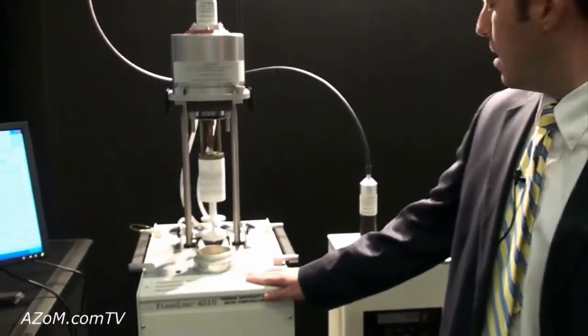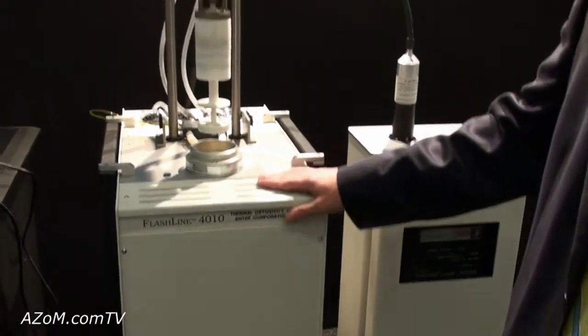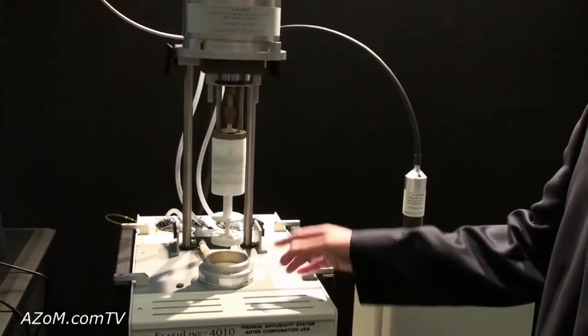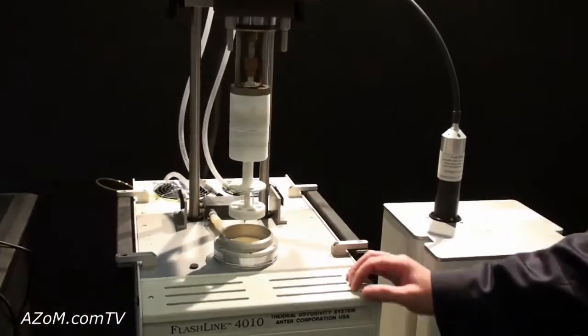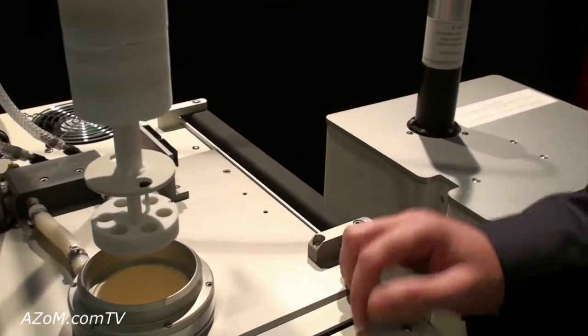This is our Flashline 4010 laser flash system. This is the laser cavity and this is the furnace. It's a room temp to 1600 furnace. This particular carousel is a six-sample carousel so you can measure five unknowns and one known reference in one.